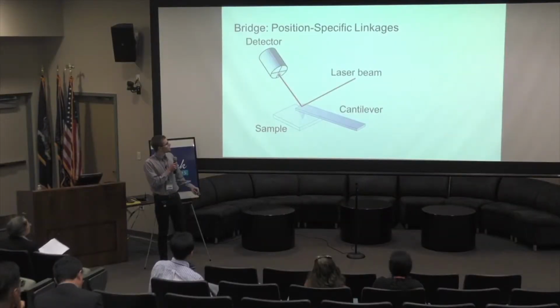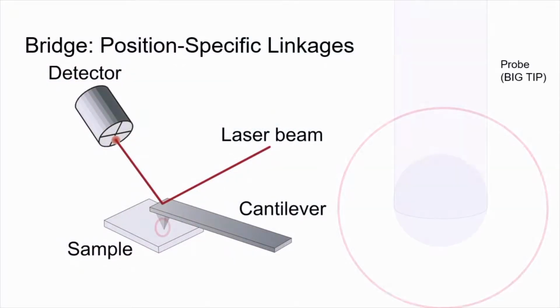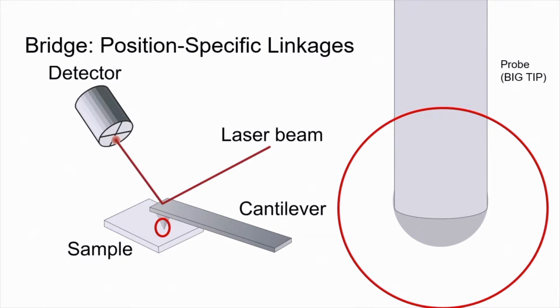The broader view of this kind of process is that you could also hope to singly, covalently attach a biological sample to a tip if you were interested in magnetic force microscopy. So then we wonder, well, what's the point of this? If we look at a general MFM setup, we have to have some sort of probe with a magnetic tip scanning over a sample. And if we zoom in on this probe, in general, if you buy a commercial probe, it'll have a relatively large tip. Someone earlier mentioned theirs was 100 nanometers.